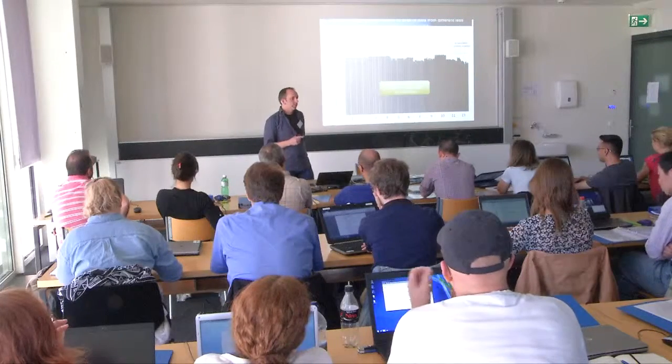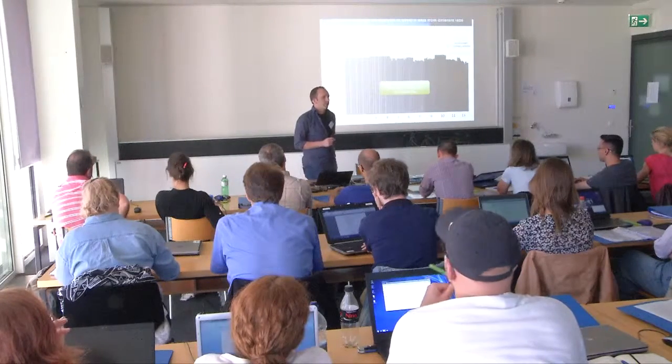There's also something I was going to mention tomorrow, but I can quickly summarize that. What Jared said is that you cannot optimize the energy for all the peptides in the window. So we do the same thing as him. We set it for a 2+ ion that's in the middle of that window. So for the SWATH analysis, each window has a fixed collision energy across the whole run. We can't make any on-the-fly decisions about this.